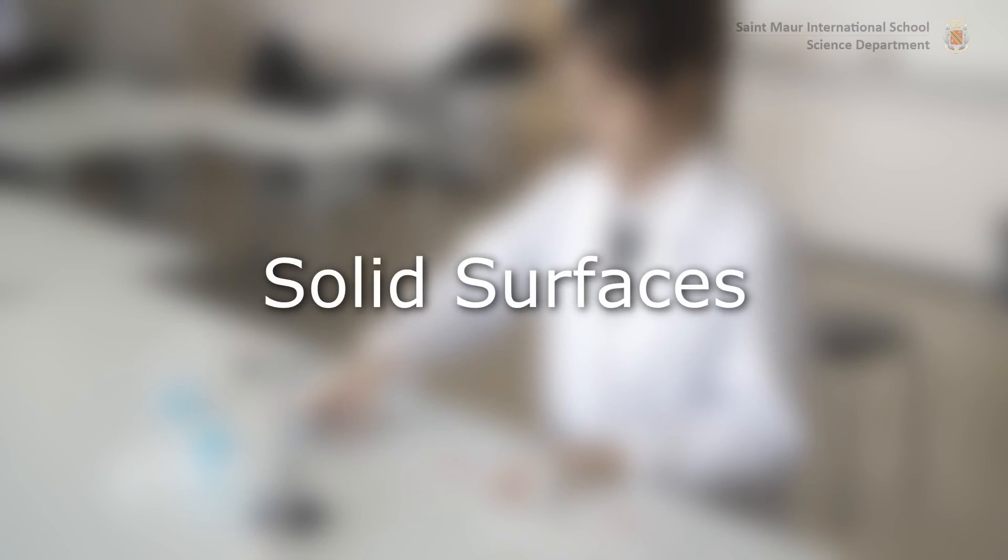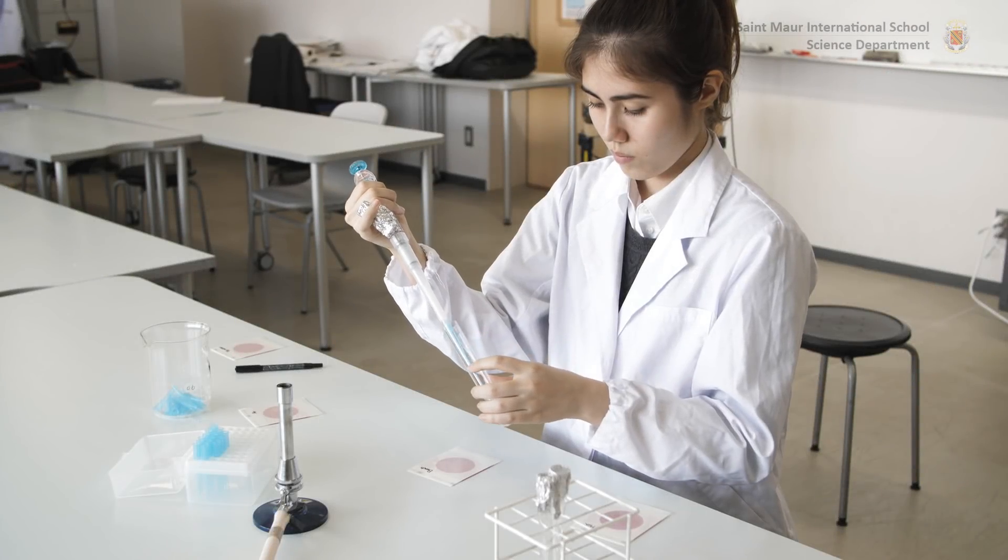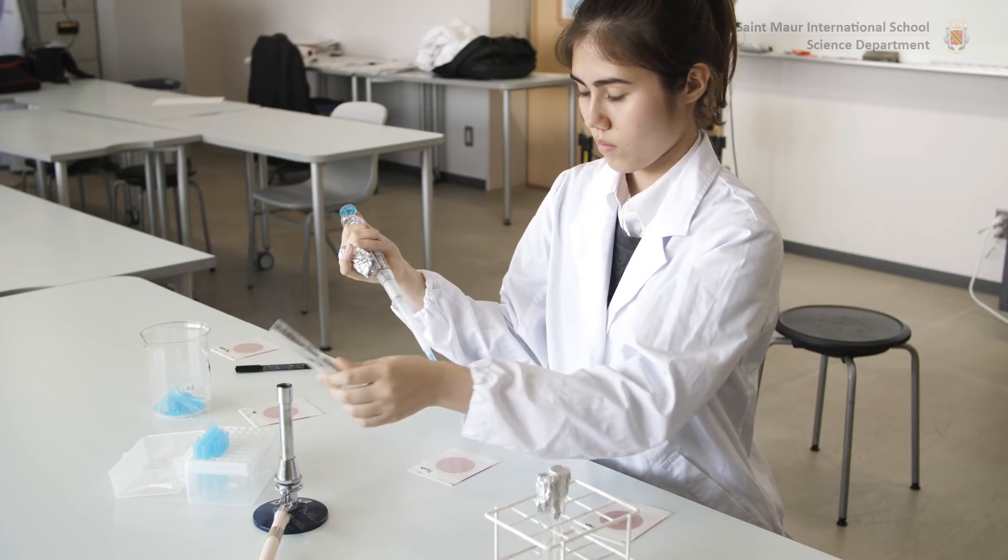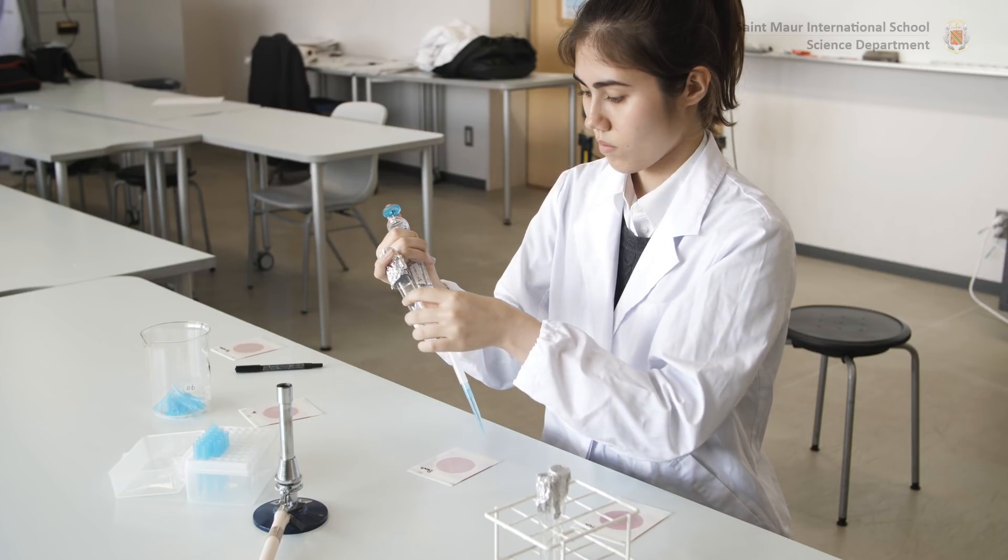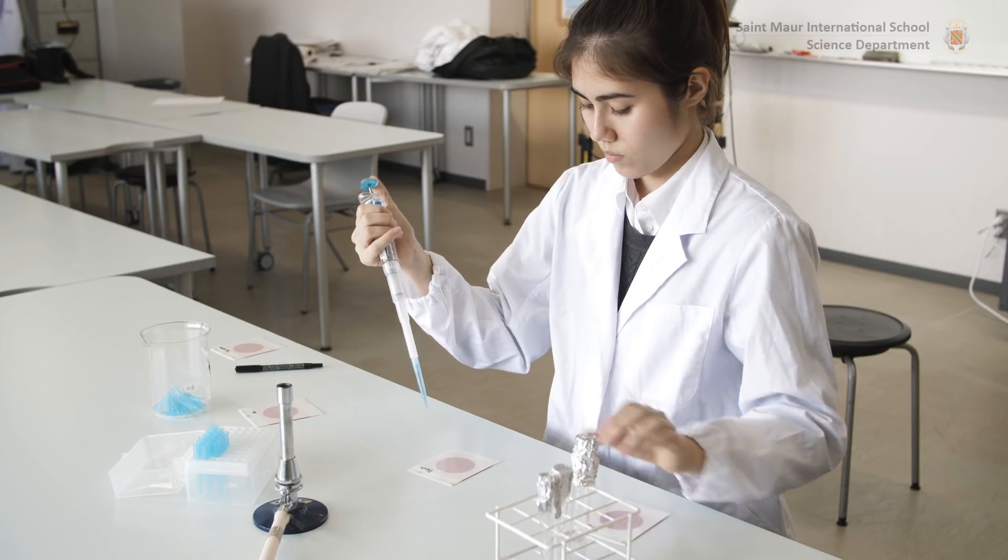Microbial load estimation on solid surfaces: For surface sampling, the Petrifilm must first be jellified by adding 1 milliliter of an 8.5 grams per liter sodium chloride solution that has previously been sterilized by autoclaving.